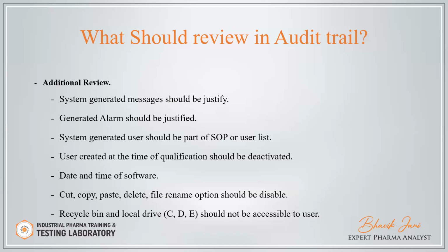Date and time of the software, and the cut, copy, paste, delete, rename options should be disabled. You have to also check the date and time, and that cut, copy, paste should not be available in user login. Recycle bin and local drive should not be accessible to the user.